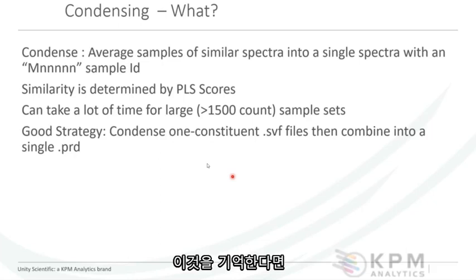And if you remember, we were talking about calibrations, we were talking about expansions during the quantitative model types. And we said that, when you are doing a calibration expansion, it becomes effective when you've got at least 5%, hopefully 10% new samples.